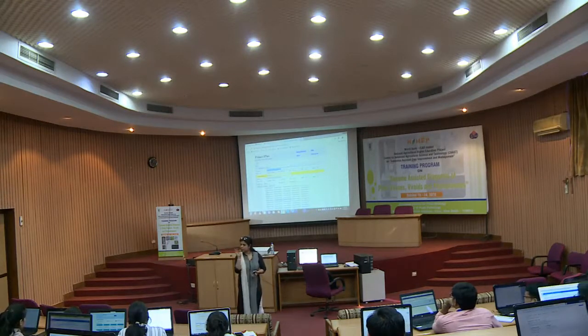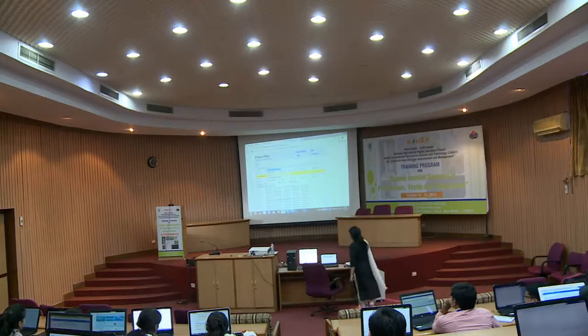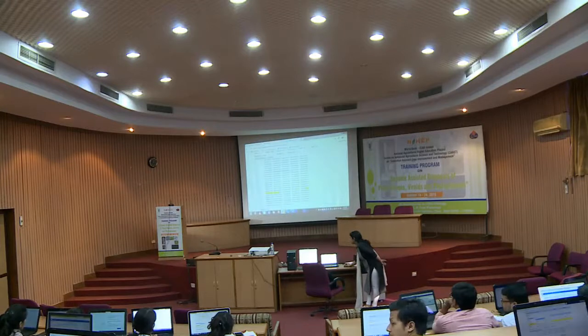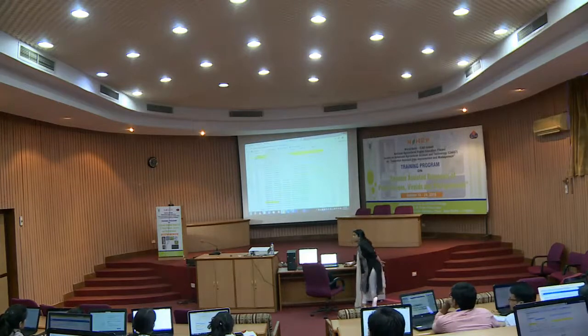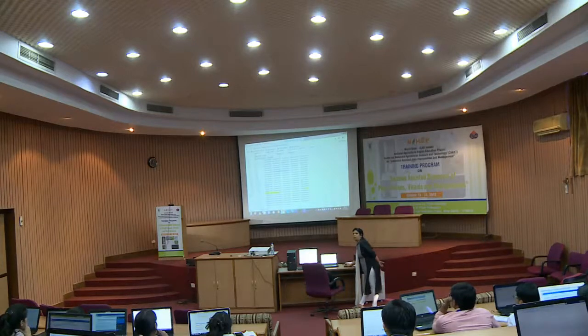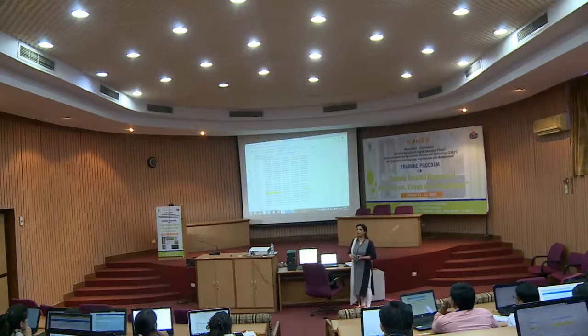Because here you will be putting that sequence, na. If some internal primer is there, then the location you can find out, na. Here it is highlighting where it is designing the primer, right. Let us suppose I would have entered around 900 to 1000 bases. So, one primer at this location, another primer at this location, then this must be the internal primer only, right. So, the location of the sequence, you can decide at which point you can design one more primer.